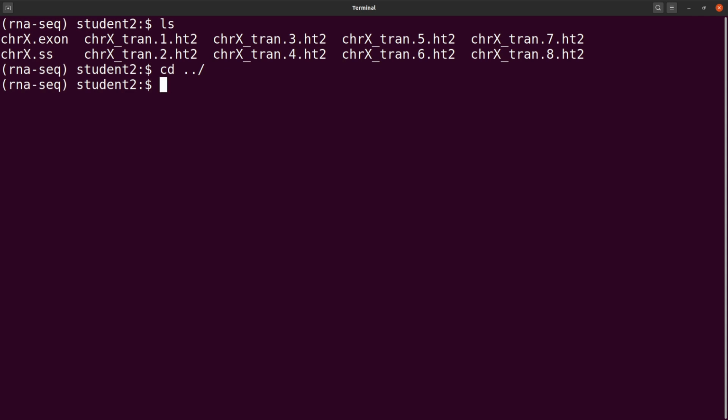The next thing we are going to do is to map the reads to the reference genome. We are going to use HISAT2. So what HISAT2 will do is that it will pick the reads, the FASTQ reads we have, and then identify locations in the reference genome where these reads best match. And then that will be used to infer transcripts that are expressed. So that is what we are going to do. So mapping in general helps us to identify transcripts, or expressed transcripts or genes, and then also gets the information about their location. So that's it.